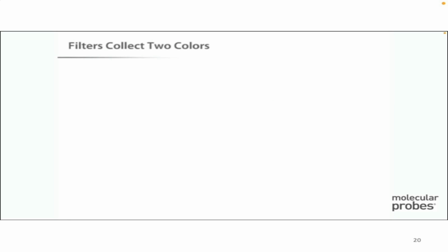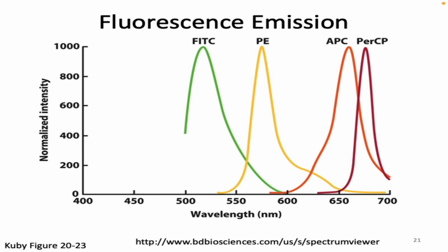Okay, so you saw this example where we have these different colored things. The example you just saw was green and orange, but it could actually be whatever colors my machine can read. When you buy your machine, you might say, okay, I want a machine that can read green, yellow, this orangey color, and this pinky color. Yes, the dyes have names, which are labeled here, but you don't care about the names of the dyes. And so then I could look at, is my cell green and orange?